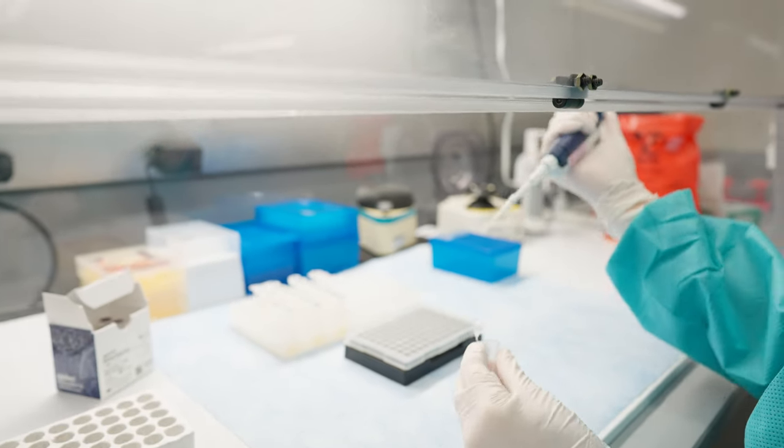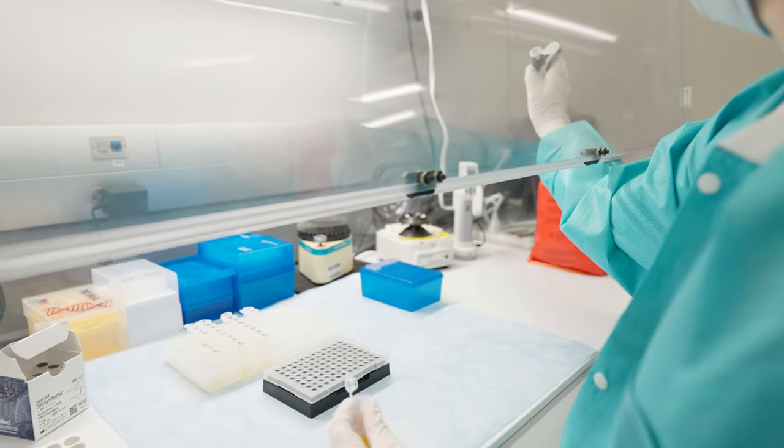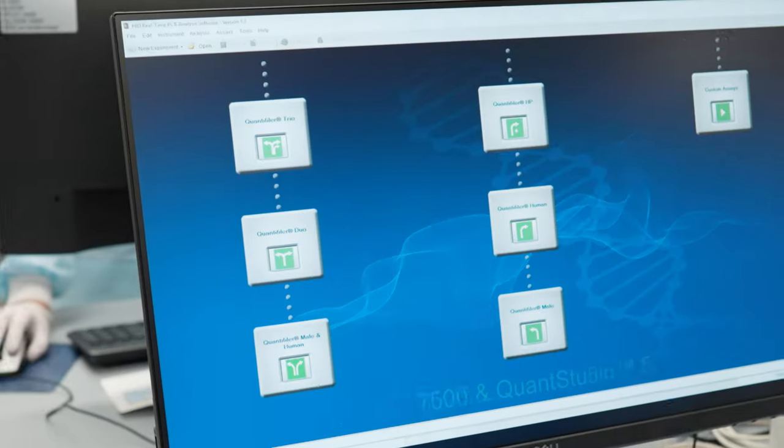For the quantitation assay, a tiny portion of the 50 microliter DNA extract is taken and placed into a PCR plate along with special reagents. We use real-time PCR instruments to perform the quantitation step.